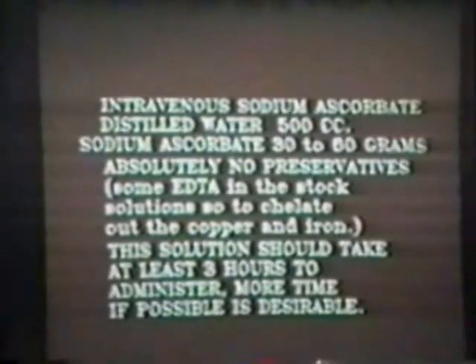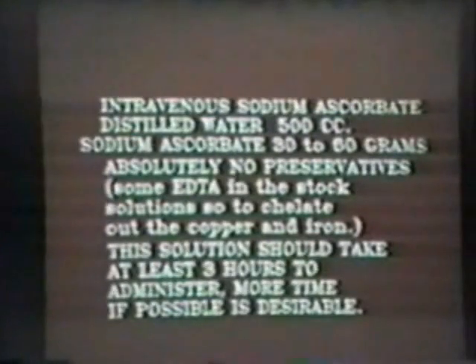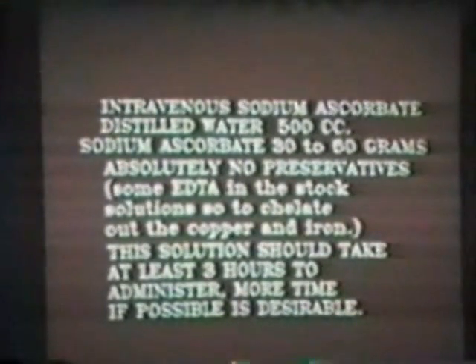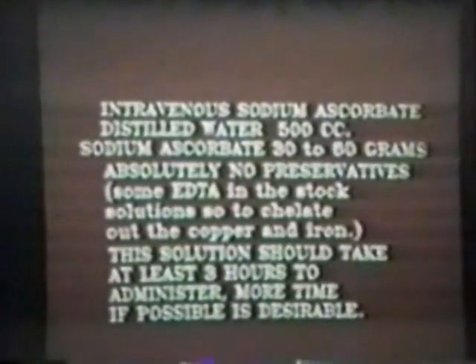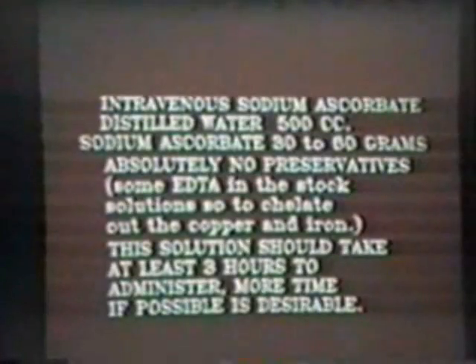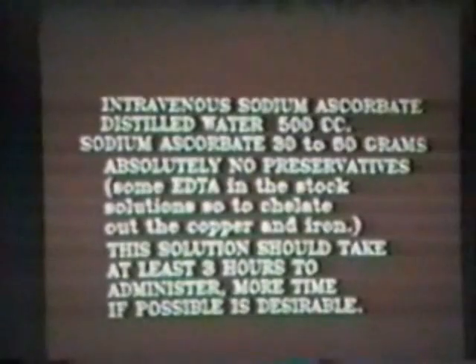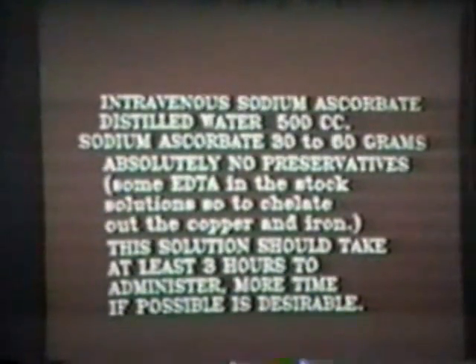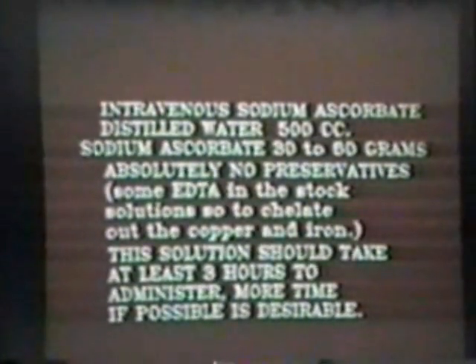I use D5 very, very rarely. I hate sugar of all sorts. So here I've got the patients off of sugars. I have a lot of hypoglycemic patients and so forth, so if I give them a bottle of D5 they wonder, what, am I crazy or what? But anyway, if I have a patient who is severely hypoglycemic, yeah, I might use D5, but usually not. And so absolutely no preservatives. There's a little EDTA in that, but other than that, it's just sodium ascorbate.